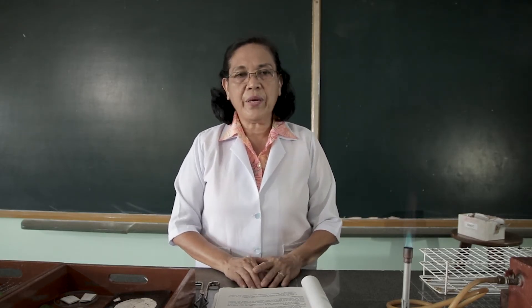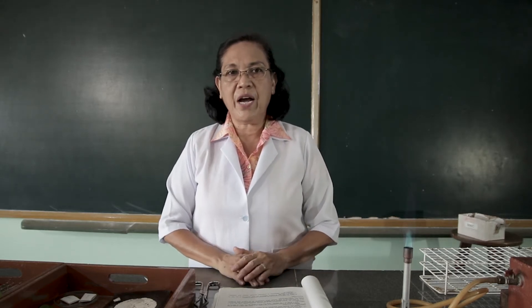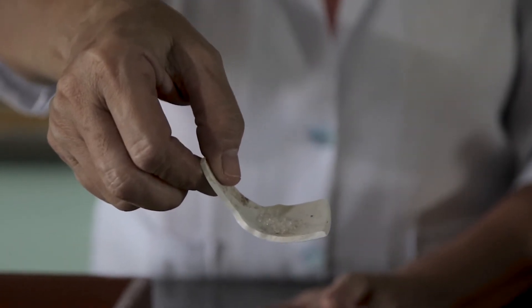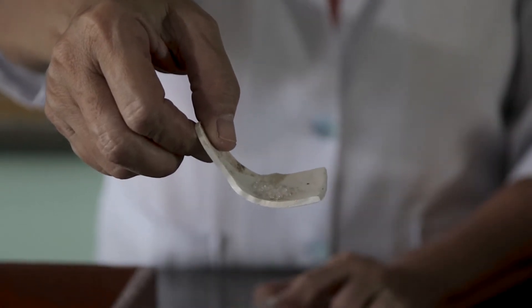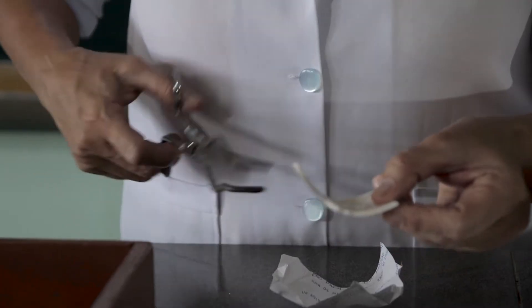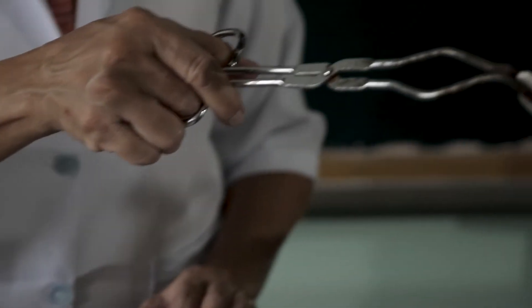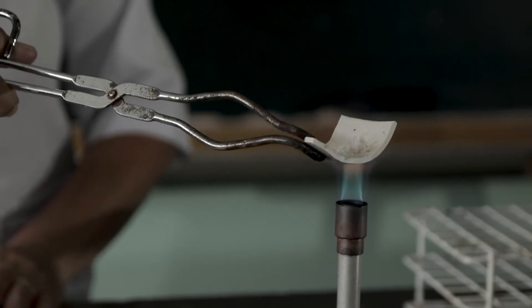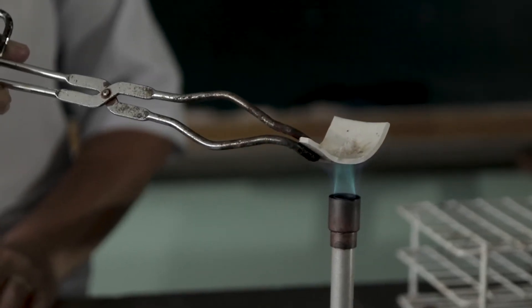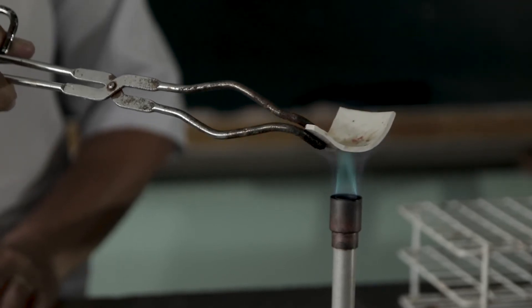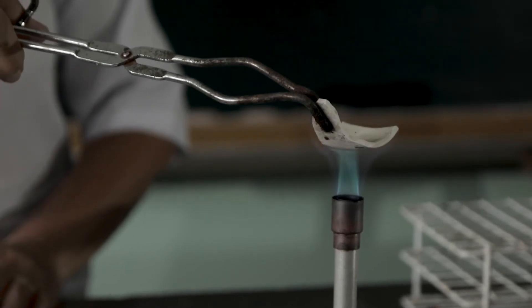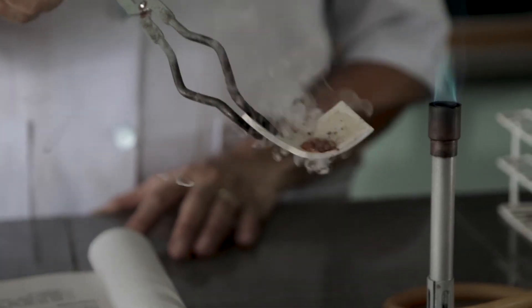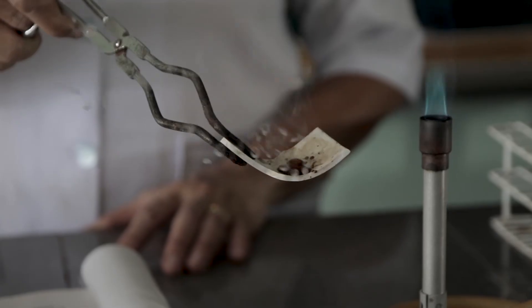First, we are going to heat the table sugar, or chemically known as sucrose. This is the table sugar. Take note of the color of the table sugar before it is heated. Then, let us heat this over the flame. Take note of what happens to the heated table sugar.